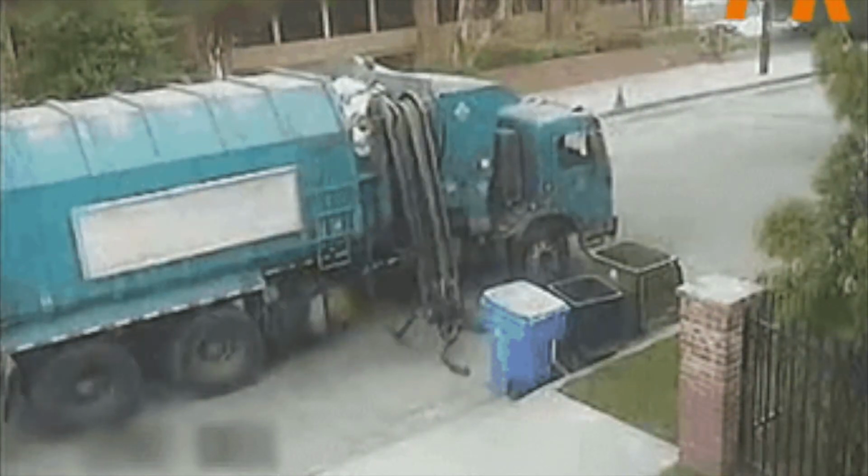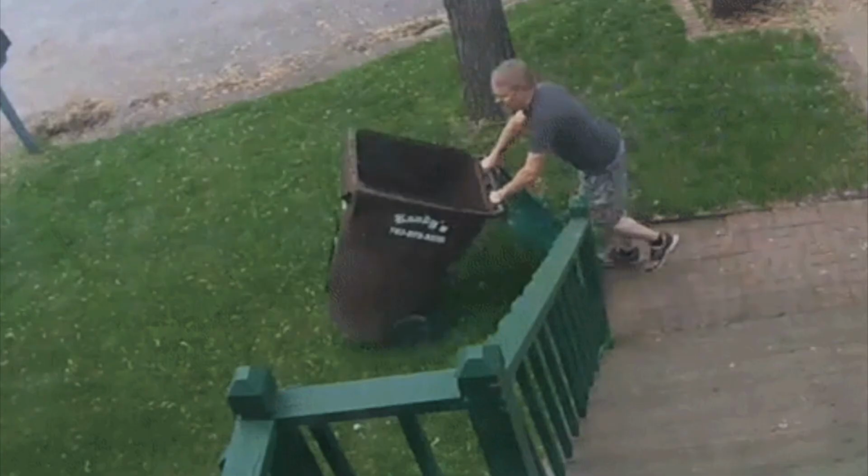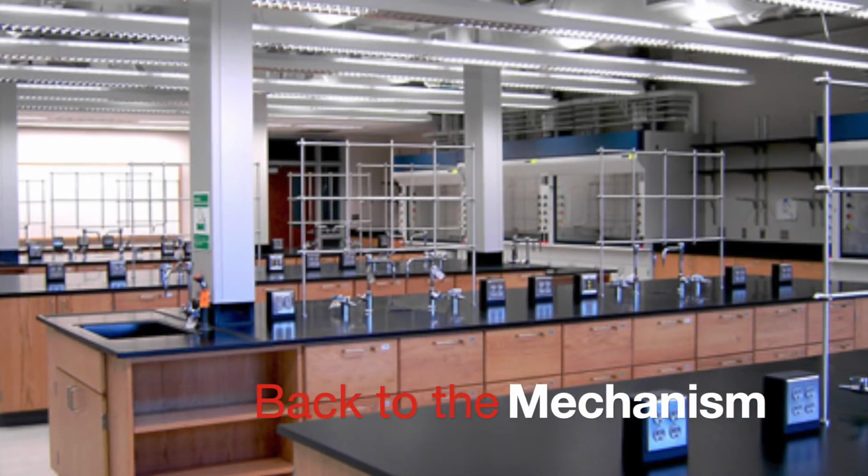And lastly, I'd like to remind you to properly dispose of all waste materials in their corresponding containers, and remember to keep your chin up. This lab won't take too long.